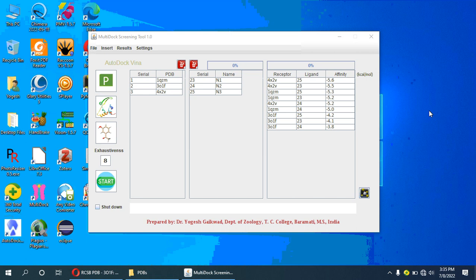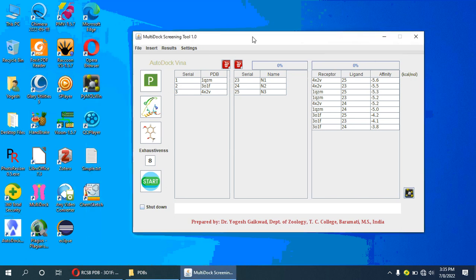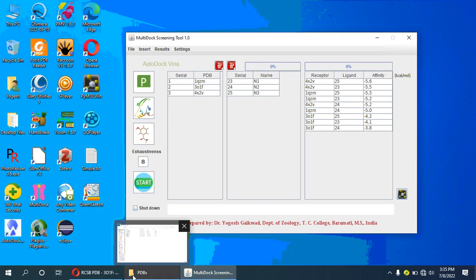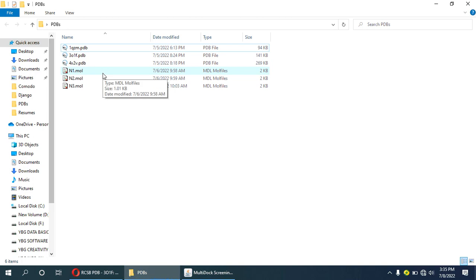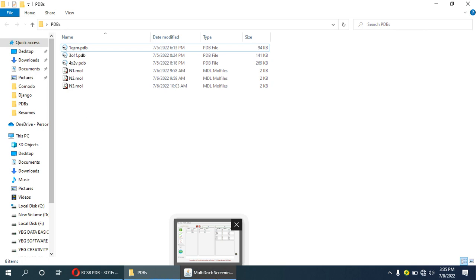Let us see a demo. For this demo I have selected some proteins — these three small protein molecules are selected, and I have created some ligand molecules which are in mol format.